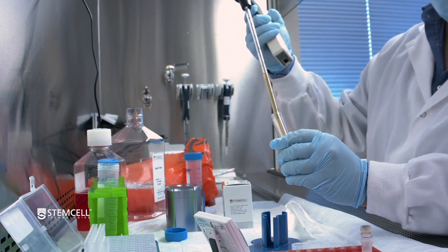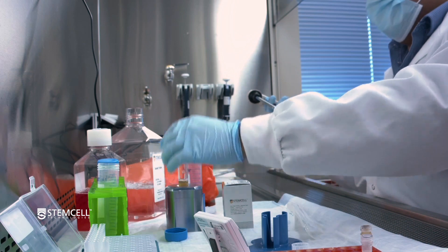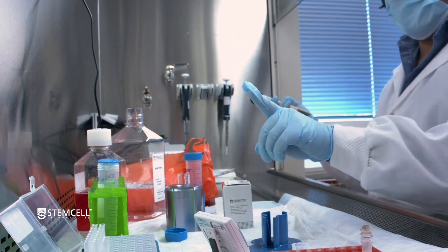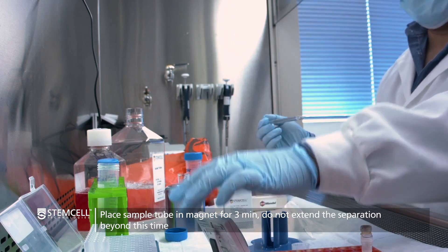So here you're just doing a nice little mix. Place this into the magnet without the cap and then start your 3-minute magnetic separation.